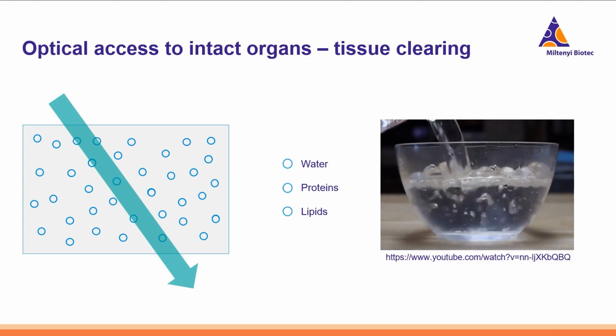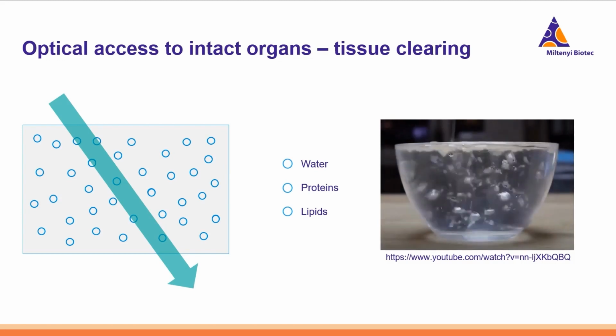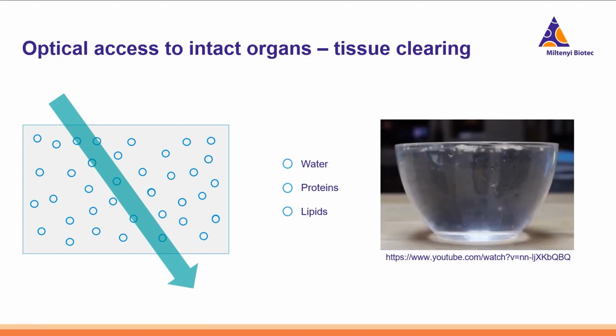What is happening is actually that the refractive index of the water and glass are much more similar to each other than glass and air. That's why the light is not refracted anymore, or it's refracting less. That's why the glass beads disappear.